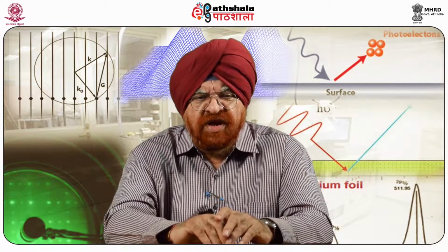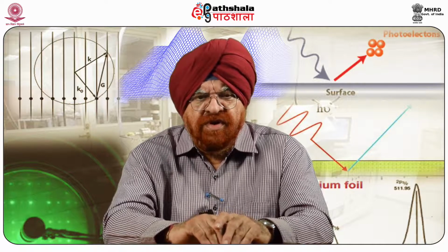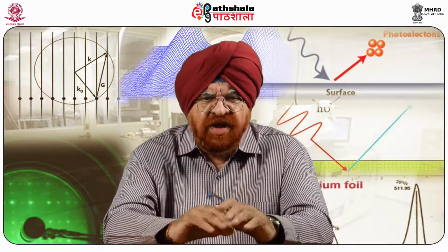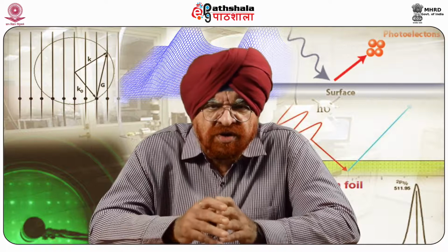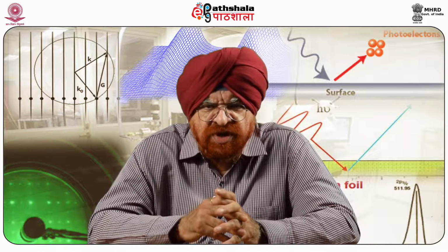Its height profile as obtained by AFM and the corresponding MFM voltage along the horizontal, vertical and diagonal dashed lines drawn in A are represented in B, C and D respectively.